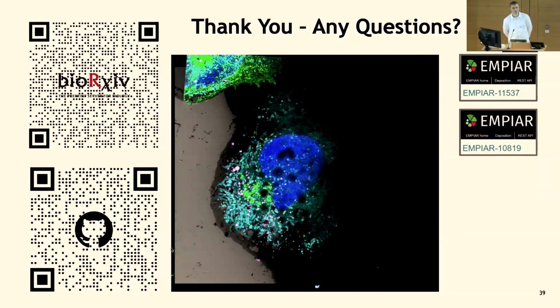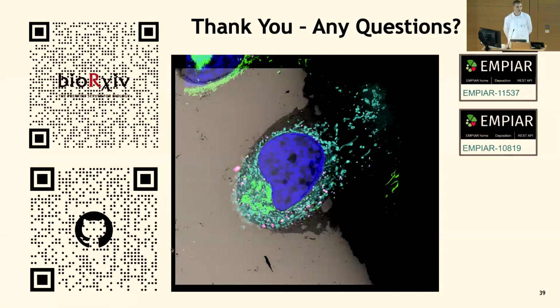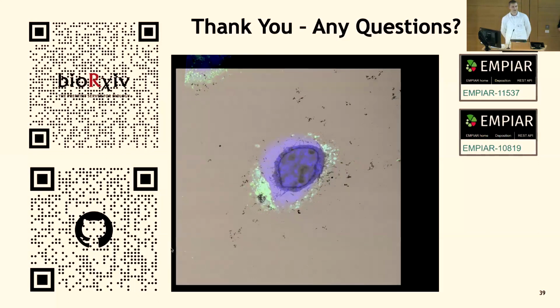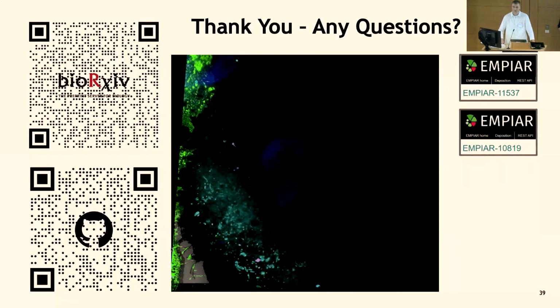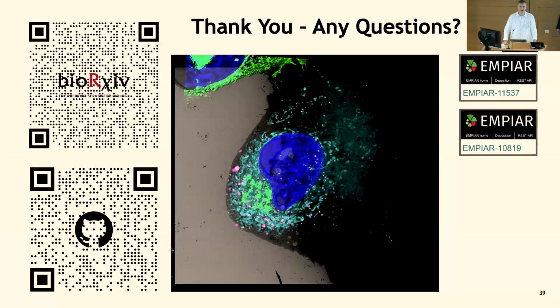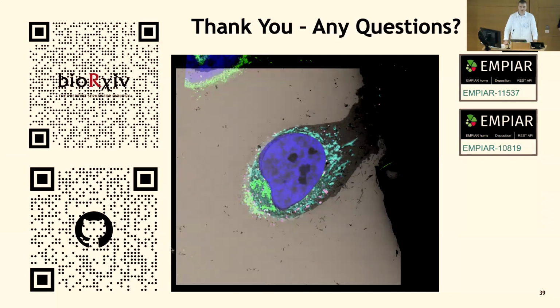So I'm not sure about whether or not we did it with other organelles other than mitochondria, but I don't think so, no. In terms of the first question, I think we do offer both, I'm pretty sure. Yeah, we do have both options available. I didn't mention this, but there are multiple registration algorithms that you can select, so depending on your needs, you can select one that works best for your data.